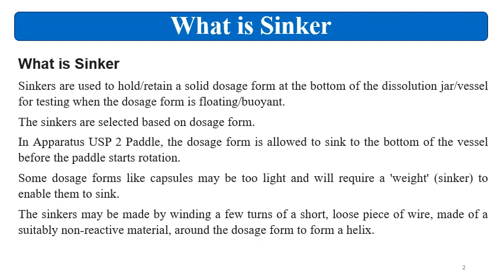Some dosage forms like capsule may be too light in weight, or some formulations which stick to the dissolution bowl will require the sinker. And sinker has a particular weight. Whenever there is a light dosage form, that time sinker will give it additional weight. That's why the formulation will go to the bottom, that will sink.